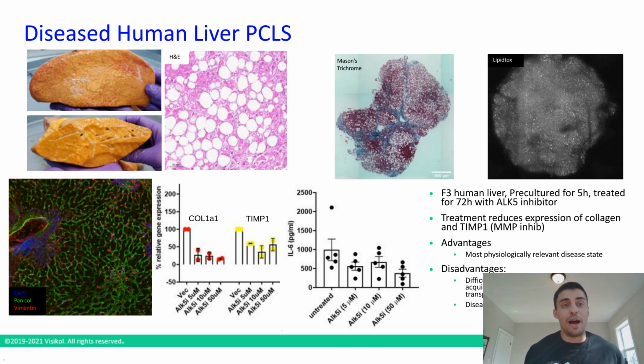So it's a powerful assay in that we're not only getting the human tissue, we're getting the human tissue with the disease state that we're trying to treat, and when we're trying to look at ameliorating the disease state in the tissue itself. So a couple of advantages. Disadvantage, of course, is the tissue availability and meeting the specific criteria that we have. There's also disease state variability.